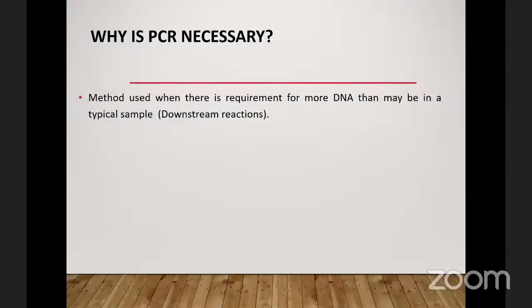to make diagnosis. So I need PCR to help me amplify that particular portion of DNA that I'm interested in. Amplification, you know what that means, like when you want to make several copies of a particular thing. I have few material in a sample. I want to make several copies of it. So it's a technique that we use to make these copies by using our cycler, and then we are able to make diagnostic sense of what we have.